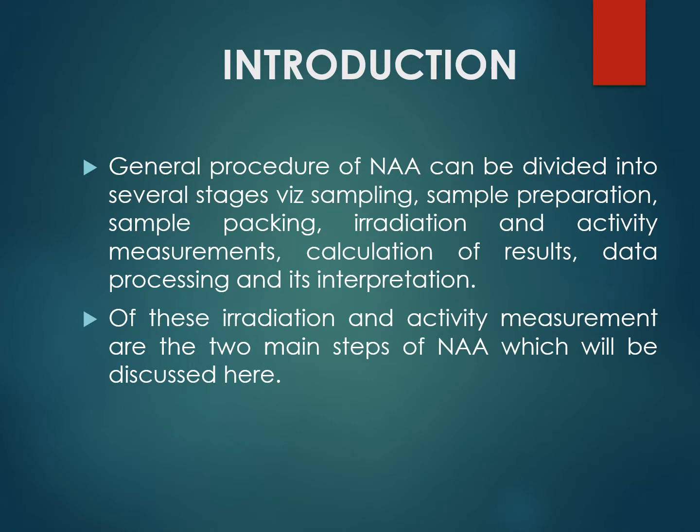By interpreting the graphs of the spectrum or chromatogram, we can interpret different results, and those results then proceed towards the conclusions and calculations. So at the end, the data processing and its interpretation is done for further analysis.